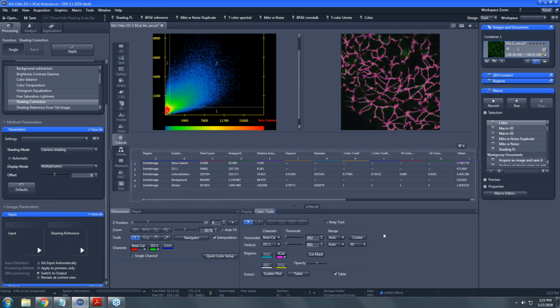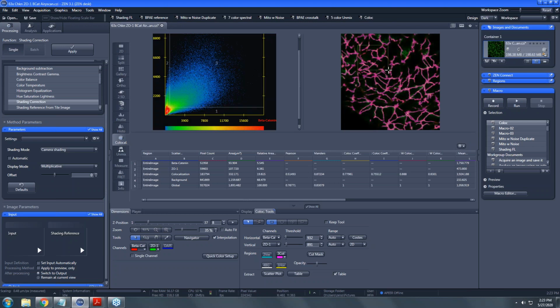So if we take one of those draw tools to demonstrate that, Nicole, we can draw around something that is of interest. And you'll notice as soon as that's selected that the table reflects not just the whole image, but also this subset. So on the table, the first 5 rows are now the entire image statistics, and then there's another 5 rows that's just this region of interest that we've highlighted.